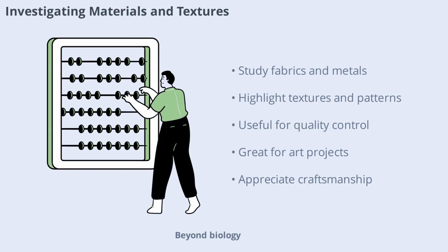Beyond biology, digital microscopes are great for studying materials like fabrics, metals, and plastics. Place your sample under the lens and experiment with lighting angles to highlight textures and patterns. This can be useful for quality control, art projects, or simply satisfying your curiosity. Documenting different materials helps you appreciate the complexity and craftsmanship of everyday objects.